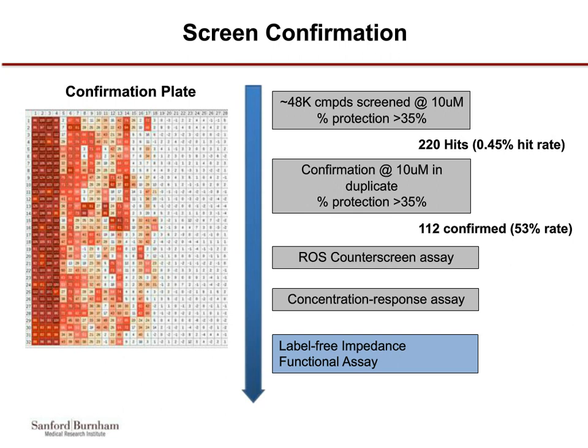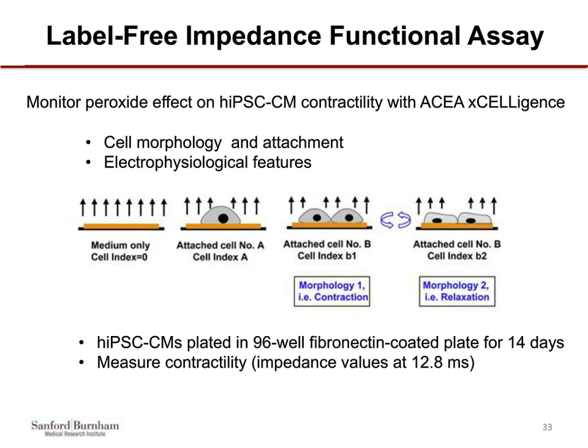The label-free impedance assay is actually a very powerful tool that we can look at, move away from just the acute time frame of our primary assay. This is a real-time experiment that we do over 24 hours. It also shows response as well as potential toxicity of compounds.